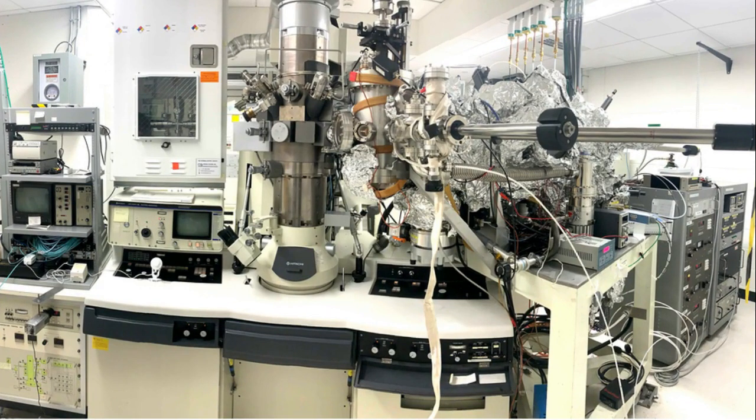In one of these instruments, a microscope is connected directly to a fabrication system so that samples can be produced on site by deposition processes and immediately fed straight into the imaging system. This is one of only a few such facilities worldwide, which use an ultra-high vacuum system that prevents even the tiniest of impurities from contaminating the sample as the 2D-3D interface is being prepared. The second instrument is a scanning transmission electron microscope. This microscope has outstanding stability for high-resolution imaging as well as multiple imaging modes for collecting information about the sample.